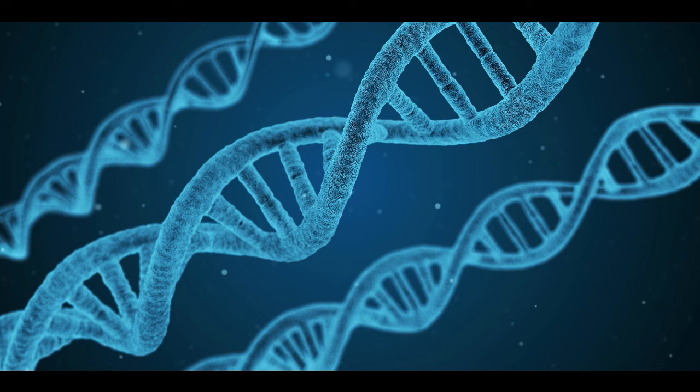It sounds like the end result is that once you get this information, like the example you gave in your discussion, Sigrid, that we looked at all these things that we thought were pretty much the same and found out that they had different DNA sequences. And then you go back to the microscope and examine, okay, how are these things different?